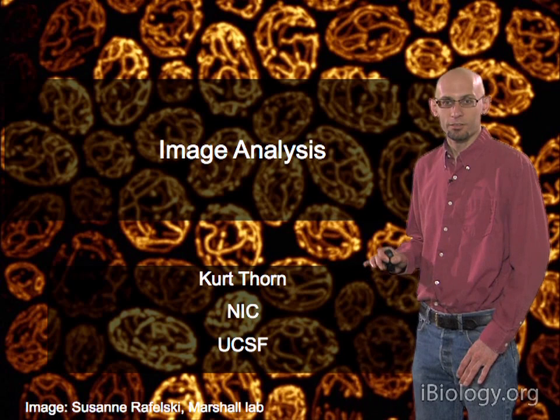Here's a bigger example. These are real microscopy images. It's a little harder to see here, but here's the original image, and on the bottom we've filtered it with a Gaussian filter. Again, it's a little bit easier to see structures in there, particularly if you zoom in on it. However, these kernels can be used for many different kinds of operations, not just smoothing.